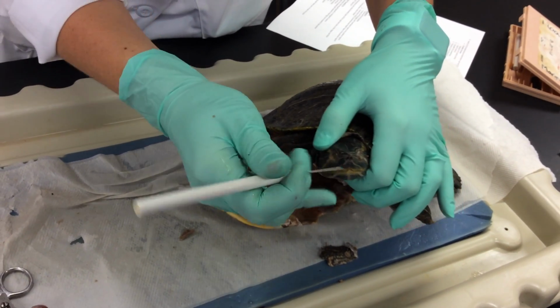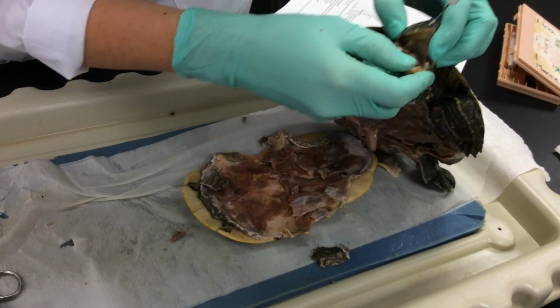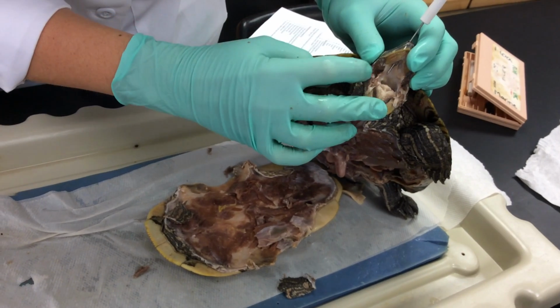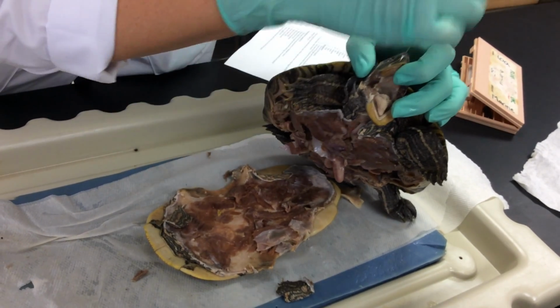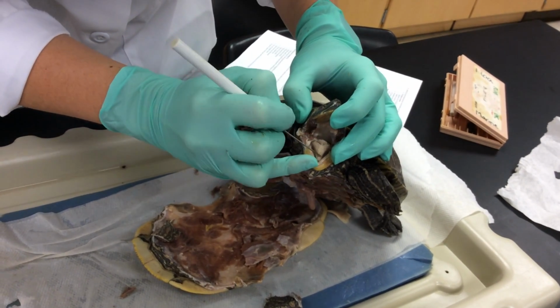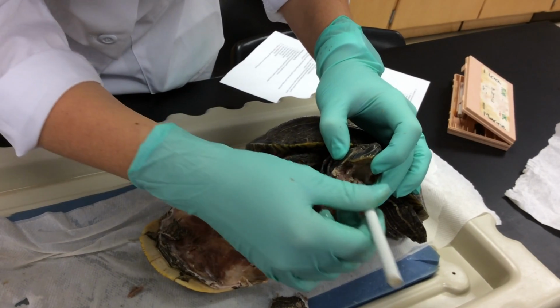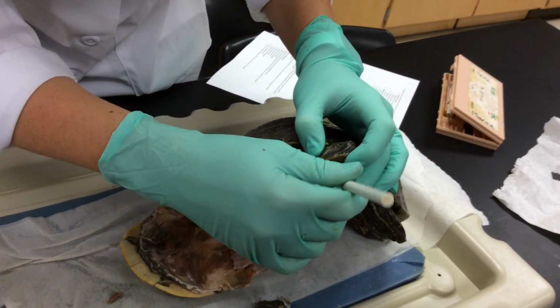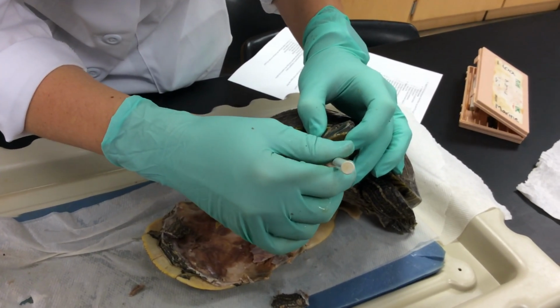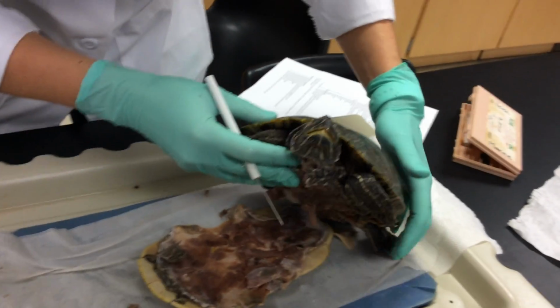And the external nares, if I insert my probe, I'm going to open up the mouth here, and you're going to notice that the probe comes out on the inside, and these are the internal nares. As air travels from the external nares to the internal nares, it'll be picked up by the tongue right here, this opening in the tongue, and this is called the glottis. The opening in the tongue is going to lead to the trachea, and this is how they're actually breathing, through the glottis itself.